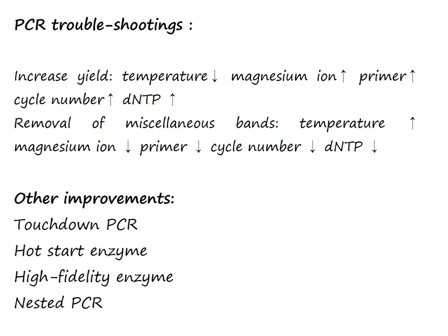There are some simple ways to increase the yield of PCR at the cost of miscellaneous bands, and vice versa. You just cannot have your cake and eat it.